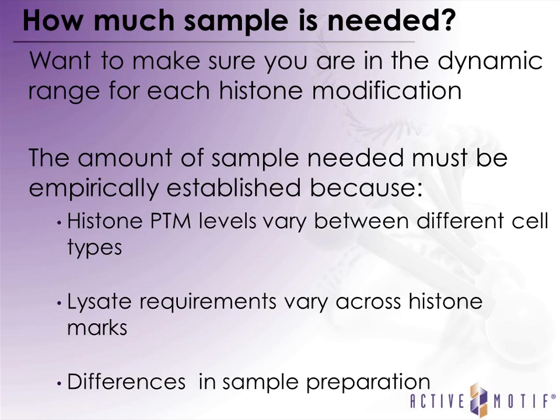And then finally, there are going to be differences in sample preparation. Depending on what kind of extract you prepare, the percentage of histones that are present may vary.